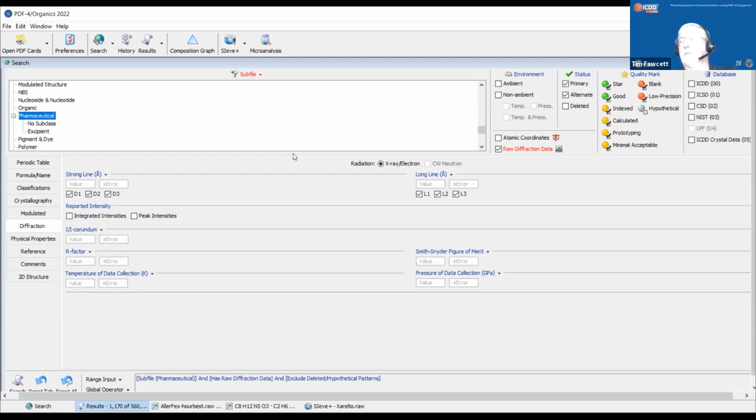I've also seen some amazing work done by a person called Simon Bates. He is a pharmaceutical expert, but he's actually analyzed the scatter of water on the surface of pharmaceuticals. And water has its own diffraction pattern, and he's been able to look at 0.15% water on the surface of pharmaceuticals using high quality lab data or synchrotron data. So you can do some pretty amazing things, but that usually takes some extra effort in the data collection. You got to get really high quality data to look at small differences like that.